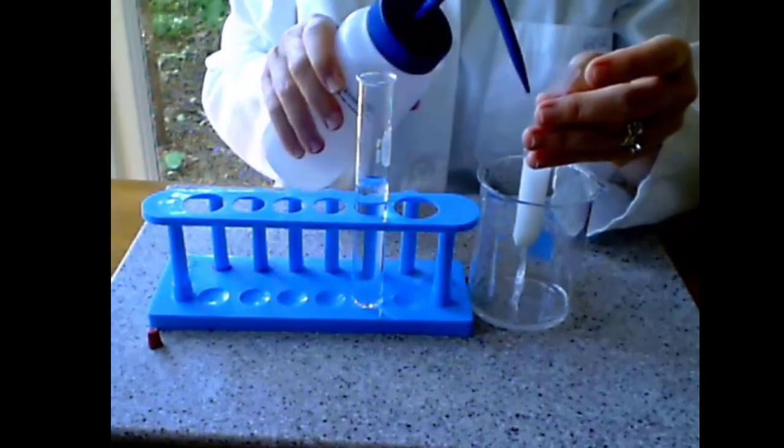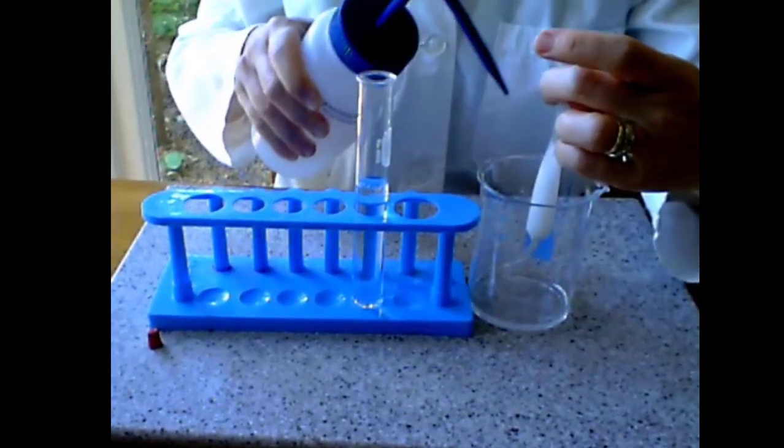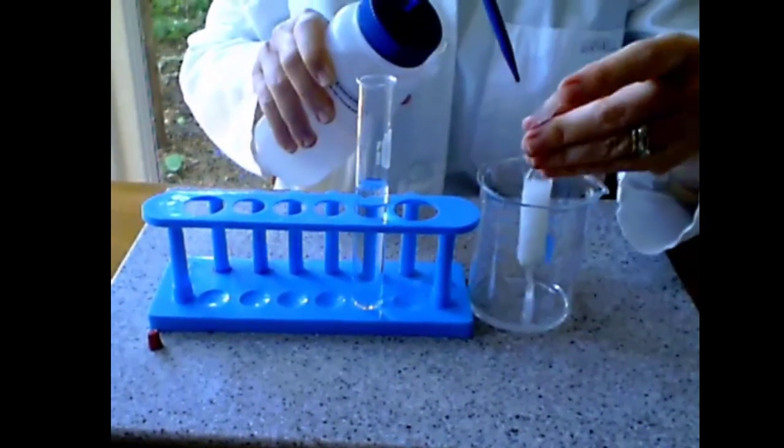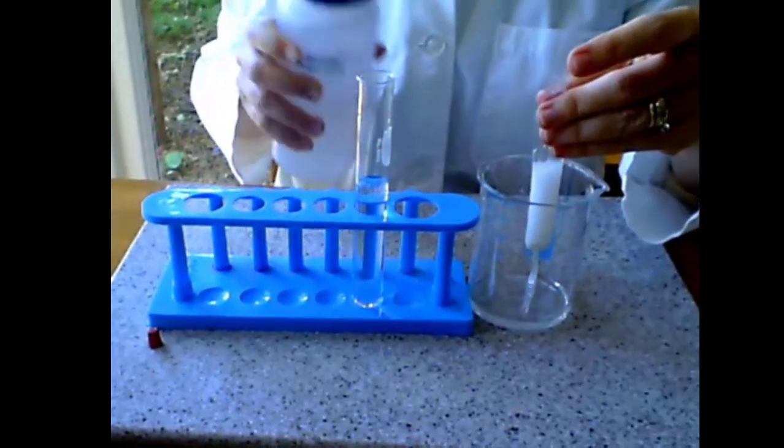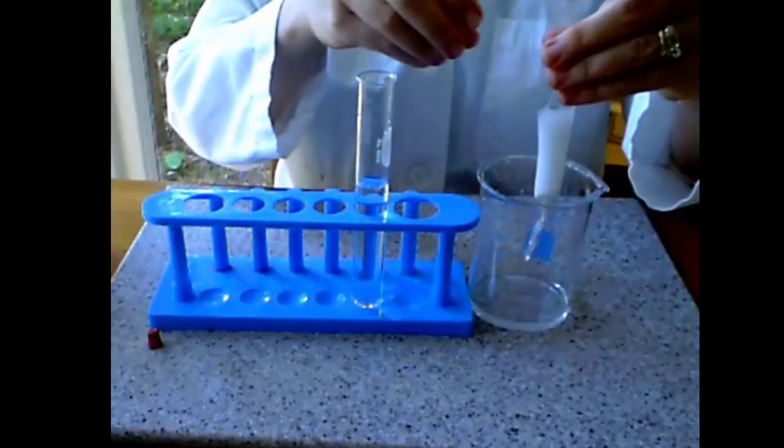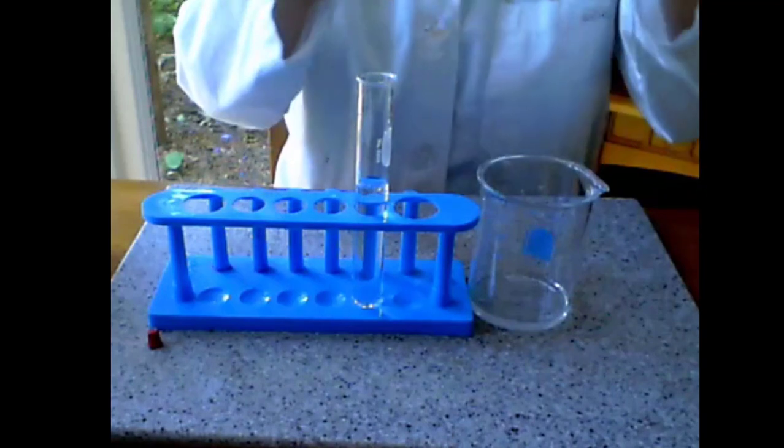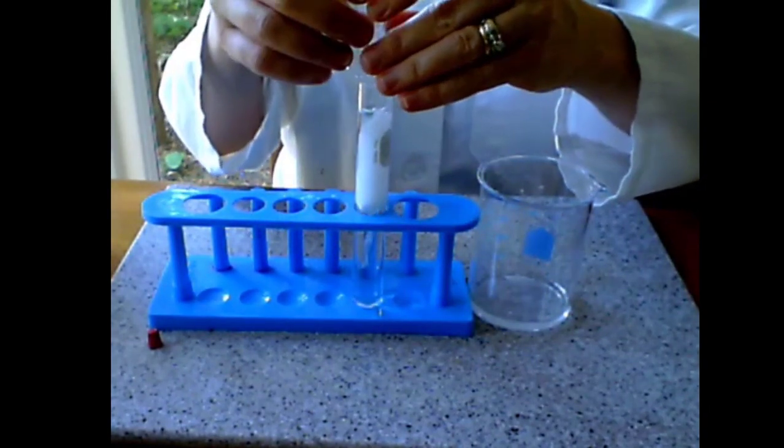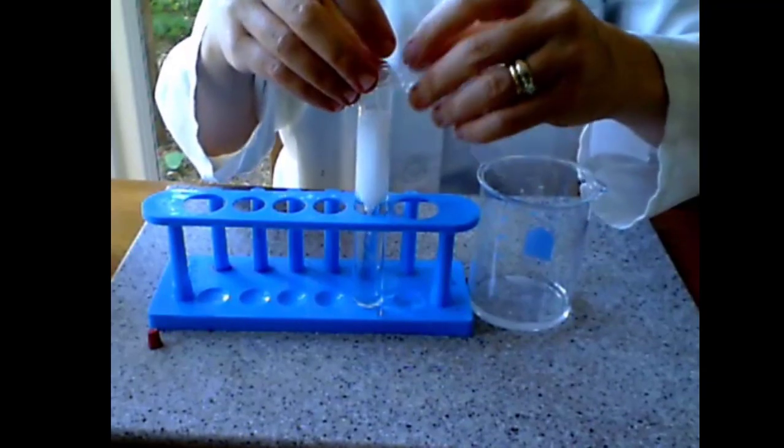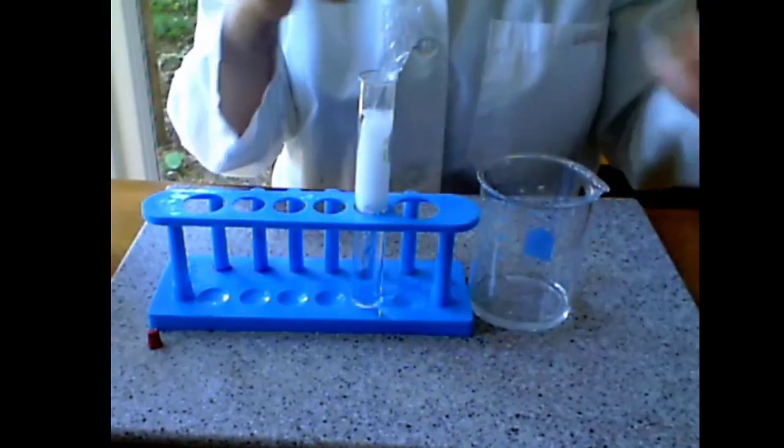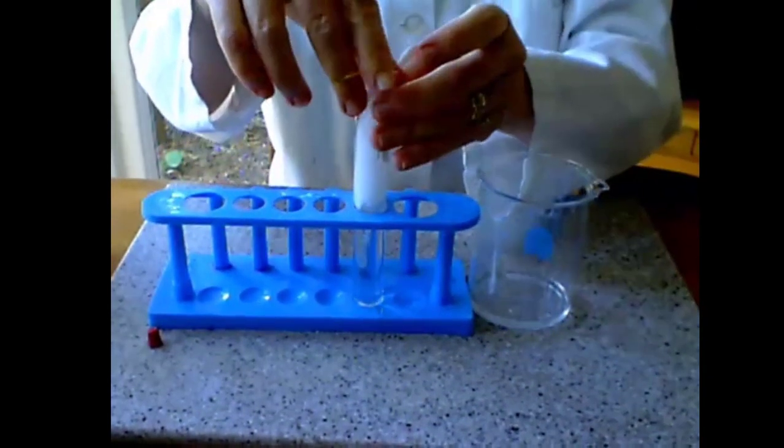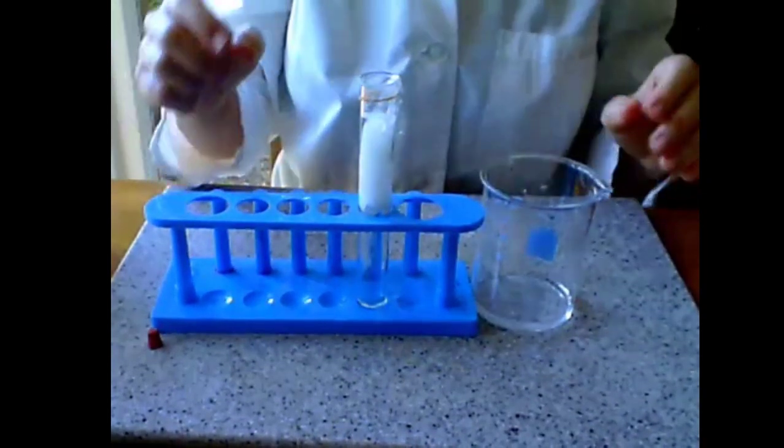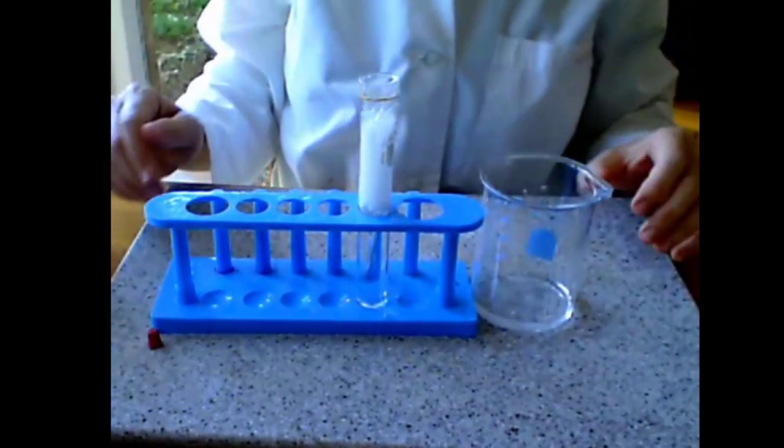We will now rinse the outside of the tubing in order to take any glucose or starch that might have spilled. And we are going to insert the tubing inside of the test tube that has pure water in it. Immerse the tubing into the water, and we are going to tie the top with the rubber band, just to secure it in place. And we leave it for 30 minutes.